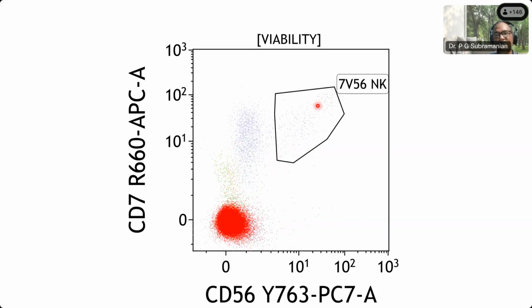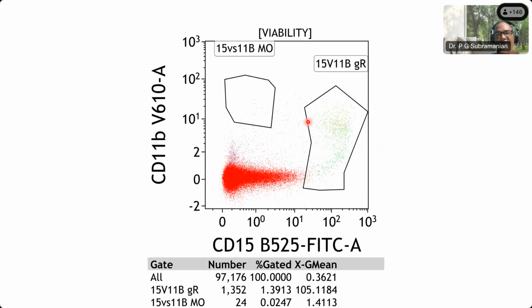So this is your CD56 positive NK cell. You are having a little bit of CD15 in the blast population. This CD11b, CD15 bright, CD11b going, this is your normal maturing granulocytes. So immature granulocytes are here, and as they mature, they go here. So this is your maturation pathway. Your blasts will be here, they acquire CD15 and then become the CD11b positive granulocytes.